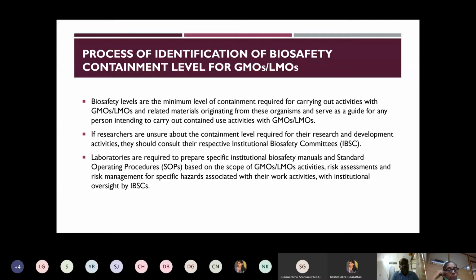And all that should be very nicely documented. Like we have general lab manuals in all our laboratories, we should also have institutional biosafety manuals and SOPs, so that everybody who is working in the labs knows about it. And there is also institutional oversight by the institutional biosafety committees. What I'm explaining to you is the correct way of working with GMOs and LMOs, which probably at this point we are not following that much.